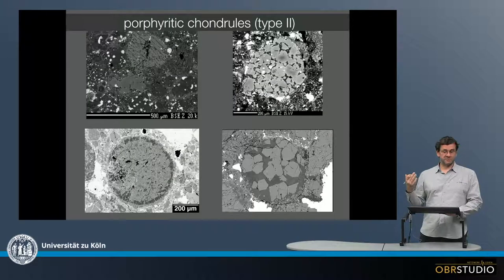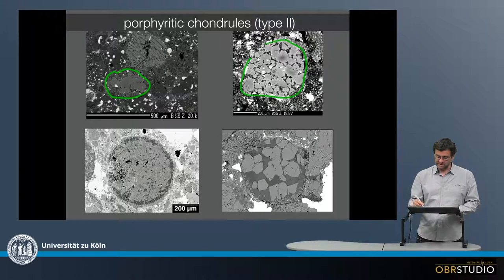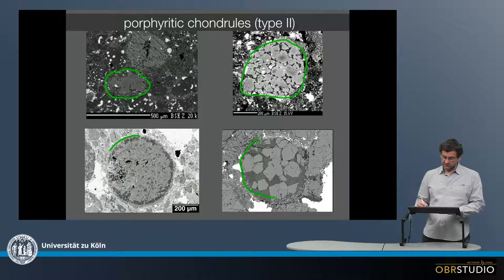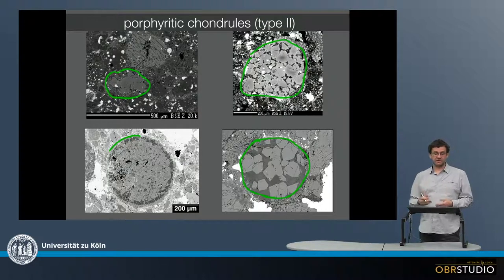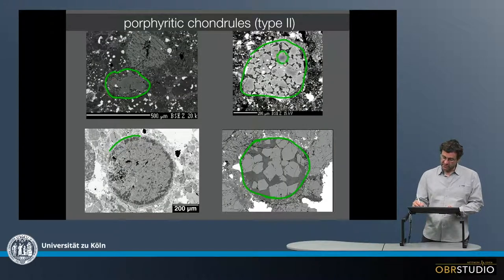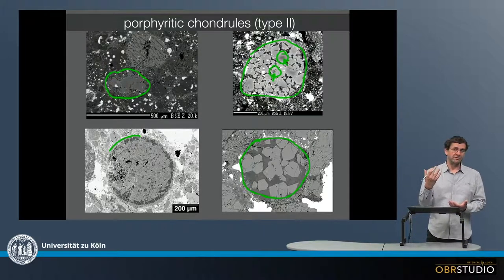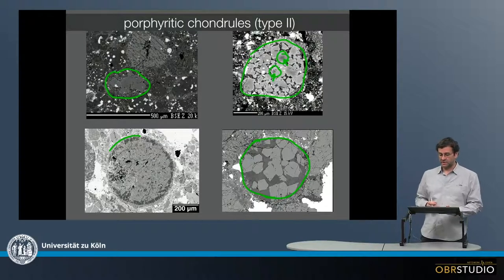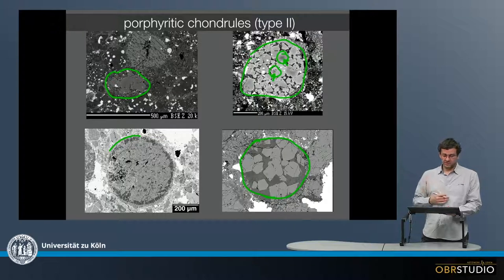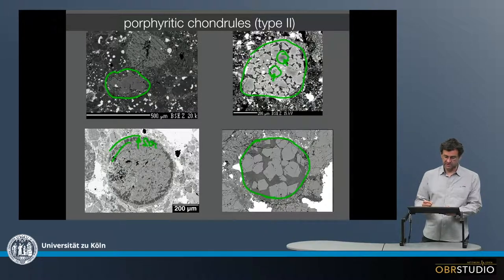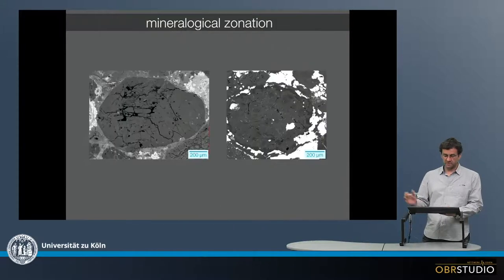Then there are porphyritic chondrules of type 2. These look rather similar to type 1 porphyritic chondrules, but the silicates are a little brighter because they now contain iron. Some olivine grains have a more grayish core — this is a relic core of an olivine grain that initially was more magnesium-rich, and then iron was added to this olivine, thereby making it more iron-rich. Type 2 chondrules typically have less opaque phase content than type 1 chondrules. In one example here, there is a ring, but in this case it is not pyroxene but SiO₂ — this is more rare but can apparently occur.